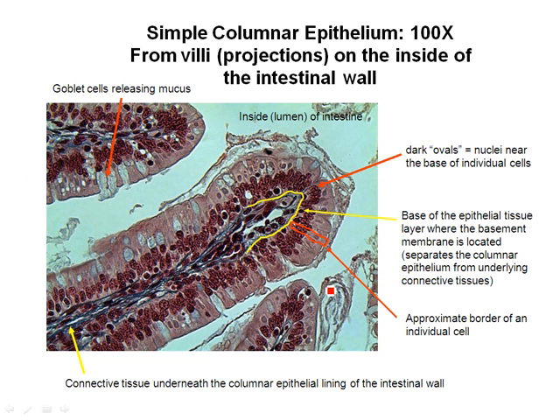All right, now this is a slide of inside an intestinal wall. And so the simple columnar epithelia, and there's a lot going on in this slide, so you want to make sure you're paying attention to what we're looking at here. When you look at an intestine, let's take a cross-section of intestine. So here's your person, okay? Here's their lower intestine. We're going to take that long intestine, stretch it out like a tube, and take a cross-section of it. So now we're looking at the cross-section. We're looking down inside the tube.